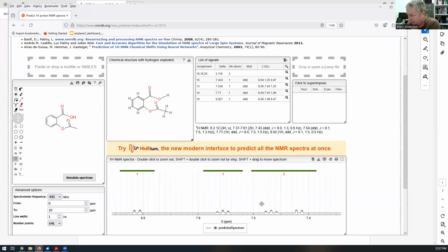Then we've got the other triplet, where there's a little bit of a bug, which is showing both of these CHs as one little thing. It's a little bug in the software. But you can see one of them is the triplet, which is probably that because there's 2 neighbors, and the other is the doublet. Net effect, you can assign the four letters using the simulation, and we're using a little bit of common sense. If we know there's 2 doublets and 2 triplets, and this is one doublet, where's the other doublet? The bottom. See what I'm saying?